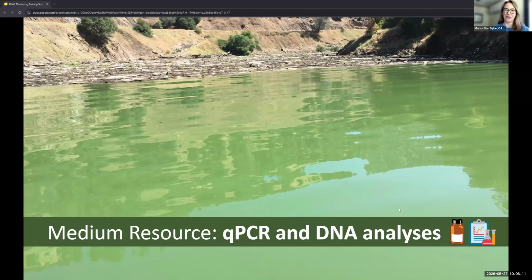Then we'll bring it all together with the lab analysis considerations into a tiered approach for analysis that's really quite popular in many programs, not just in our state and in others as well, that can be useful depending on your monitoring goals in your planning process.